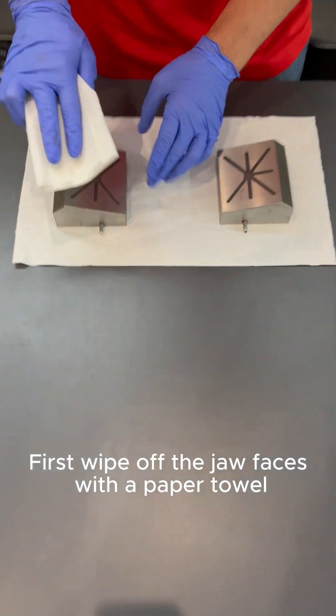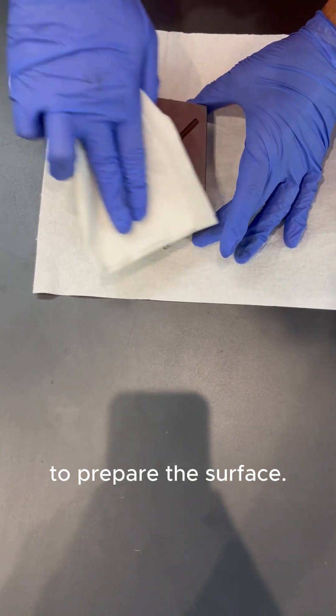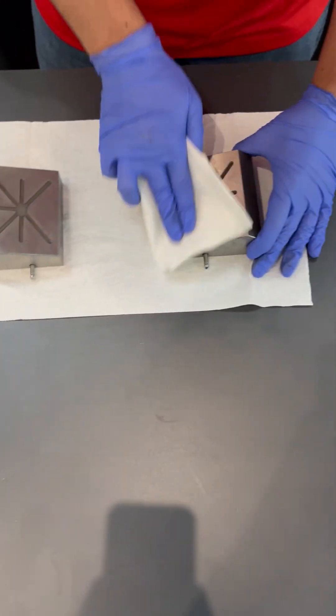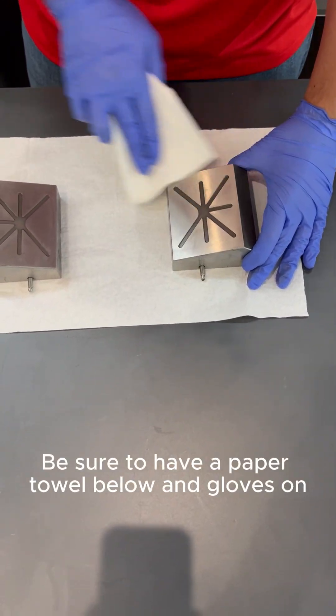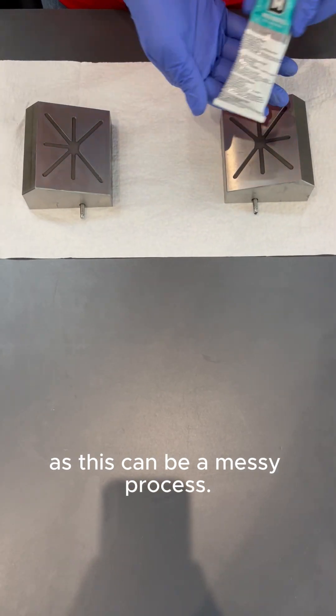First, wipe off the jaw faces with a paper towel to prepare the surface. Be sure to have a paper towel below and gloves on, as this can be a messy process.